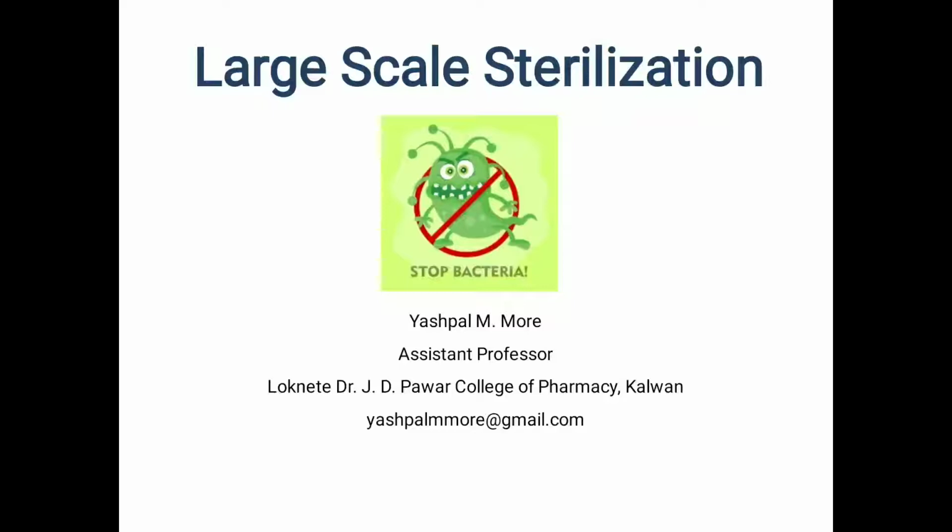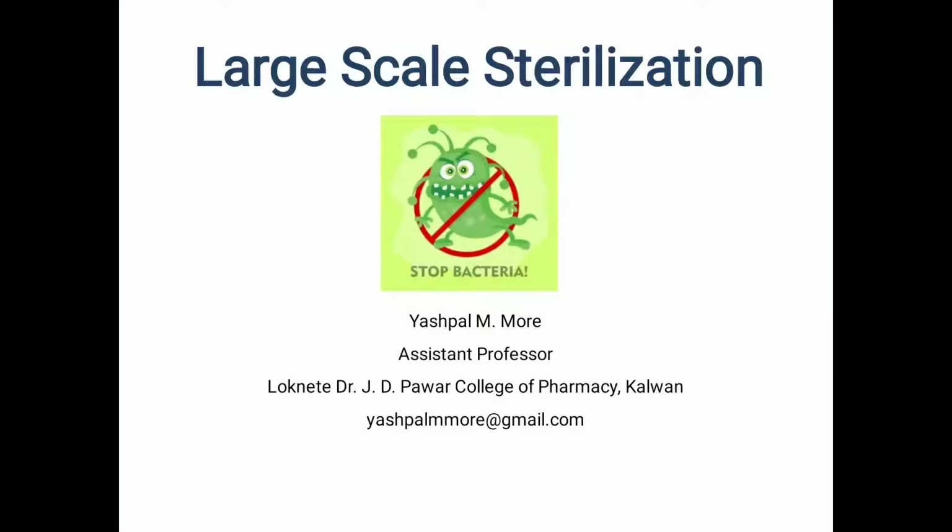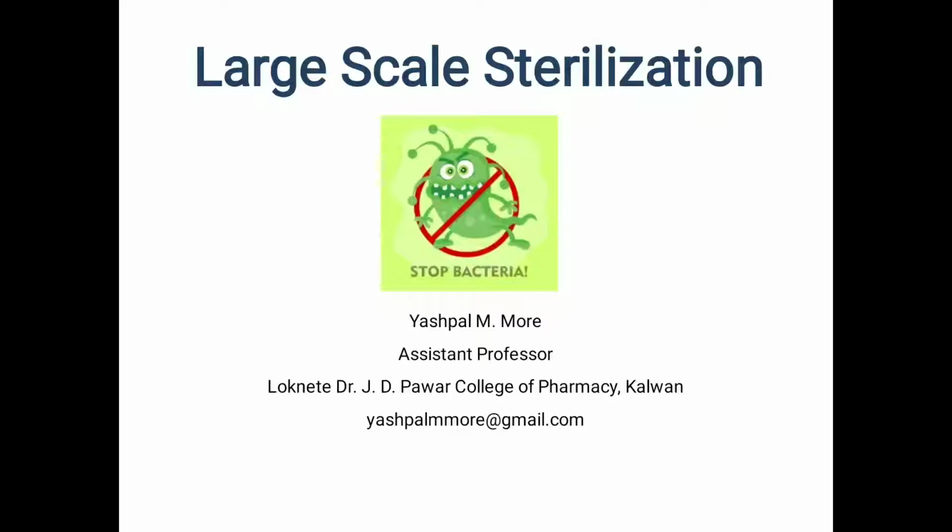Today I am going to talk about large scale sterilization. In case of sterilization, we have covered different methods of sterilization. So sterilization is a process of killing the microorganisms by which an article, that may be any glassware or any pharmaceutical preparations, are made free from microorganisms.